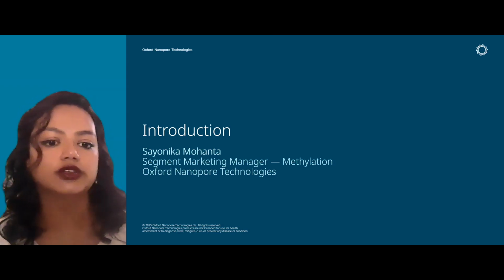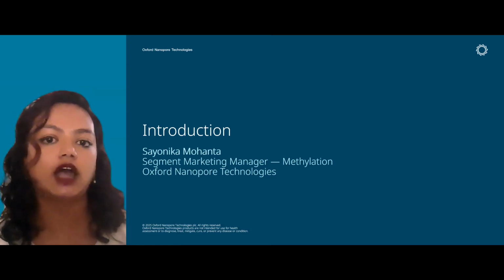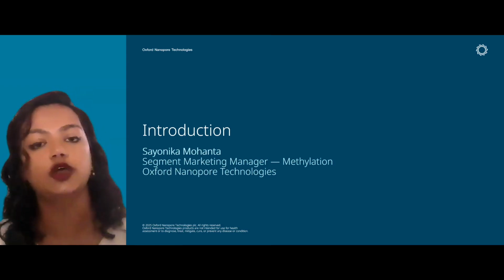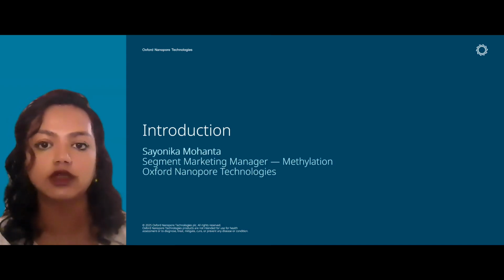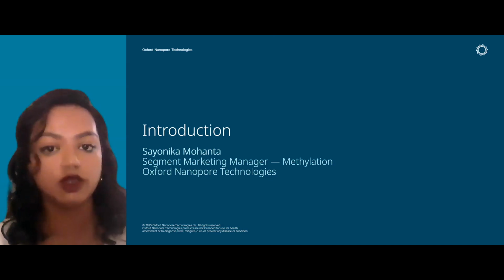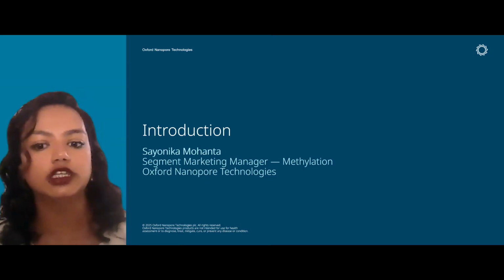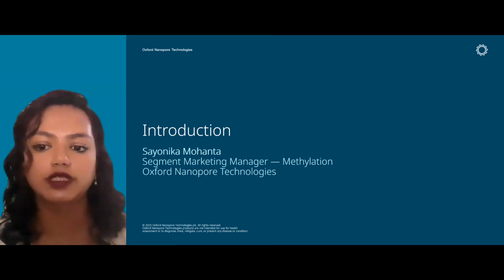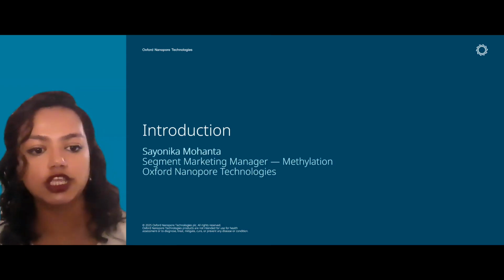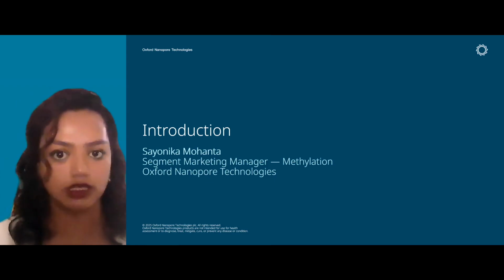Our agenda also includes Scott Hickey, the Director of Genomic Applications, who will present how whole genome and single-cell transcriptomic sequencing helps uncover insights into personalized immune responses. Then Art Rand, a research scientist in machine learning, will discuss how nanopore sequencing examines methylation and chromatin structure in normal and malignant hematopoiesis.